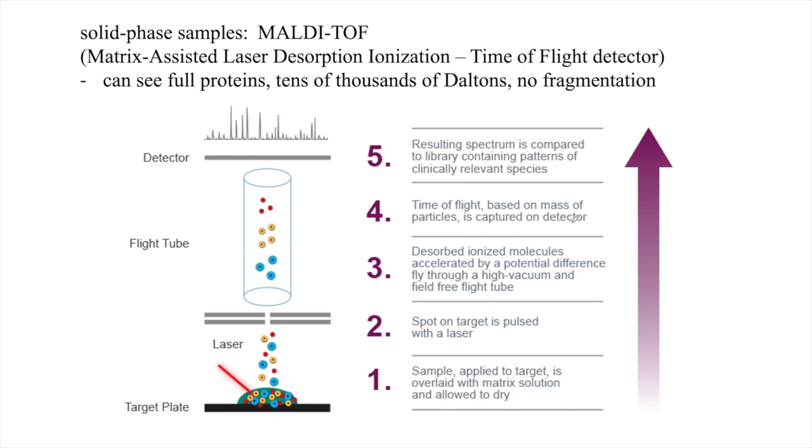Okay, so all that is liquid phase solution stuff. What if I've got a compound that I really can't even get into the solution phase? That's not dissolvable. Well, I can do solid phase mass spec. Call it MALDI-TOF. MALDI is the ionization method, matrix-assisted laser desorption ionization, and TOF is the detector method. This has a little joystick, and you load up a little bit of your sample in a little divot, and that sample has some of your stuff of interest and some of a matrix, just a crystalline compound that you mix it with.